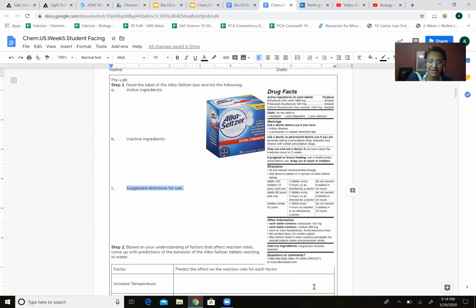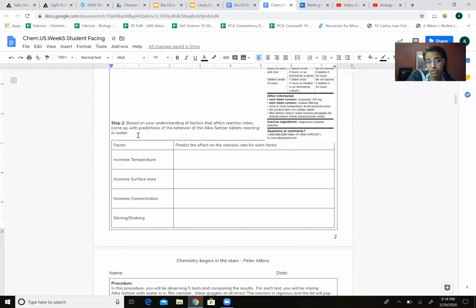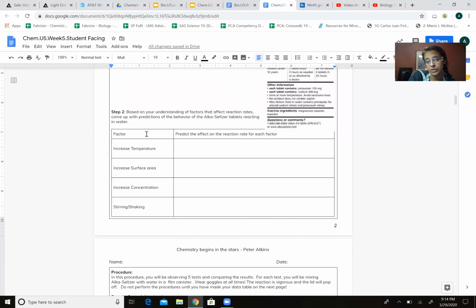Okay, welcome back. By now you should have completed step 1, A, B, C. So tell me the inactive ingredients, the active ingredients, and suggested directions for use. So that's great. So now step 2, we are going to predict what's going to happen.